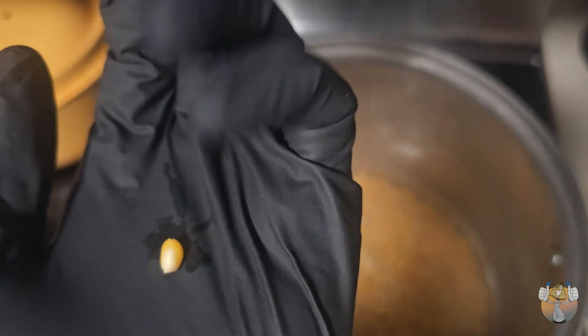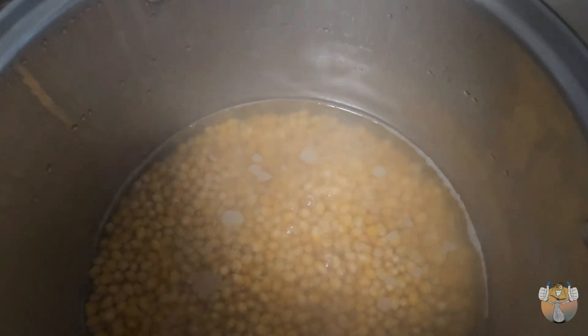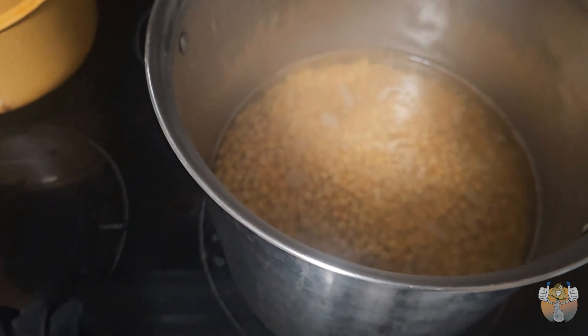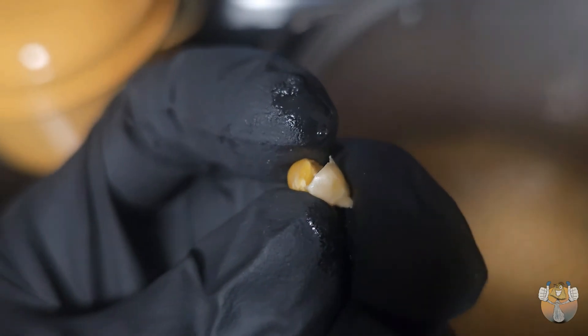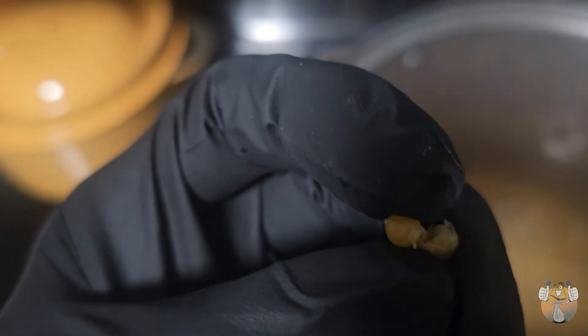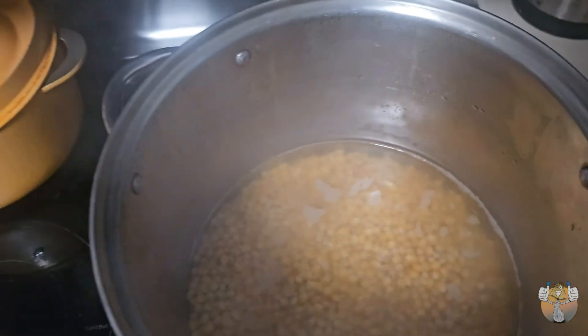We're just gonna cook that a bit more. Let's do a side by side — here is the uncooked kernel versus our cooked kernel. See the difference? It's not a crazy difference but it's noticeable. It's still a bit harder in the middle — very hard, kind of hurt my tooth to be honest. So we don't want it that hard, we want it a bit softer than this.